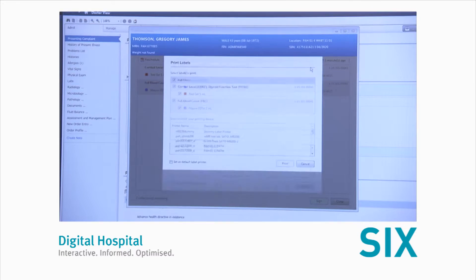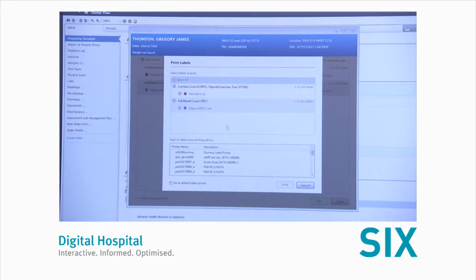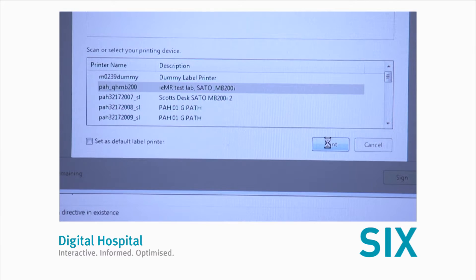Step six, select the test to be collected and select the printer you wish to print the labels to, then press print.